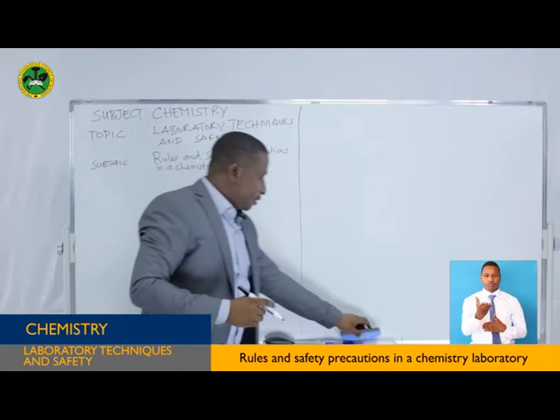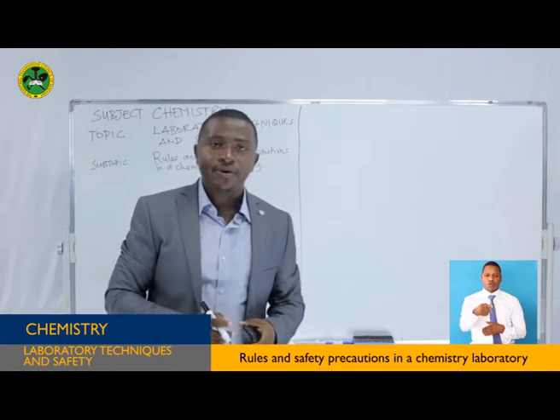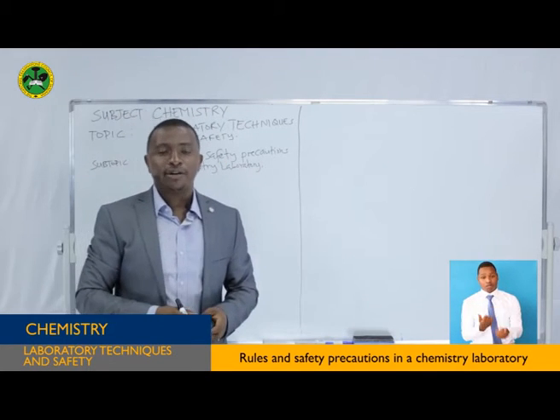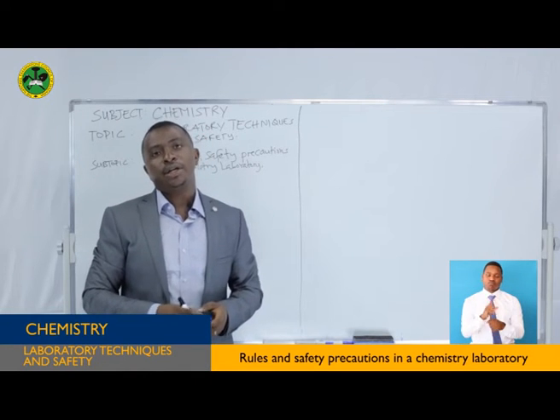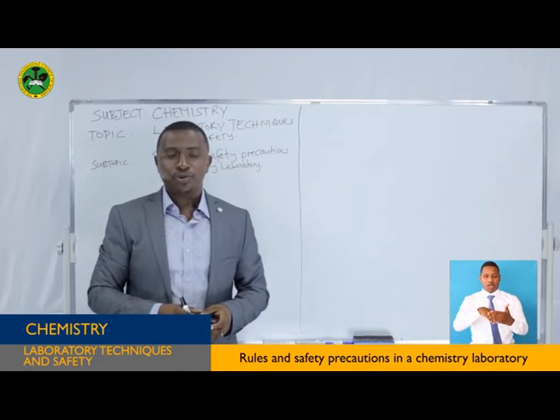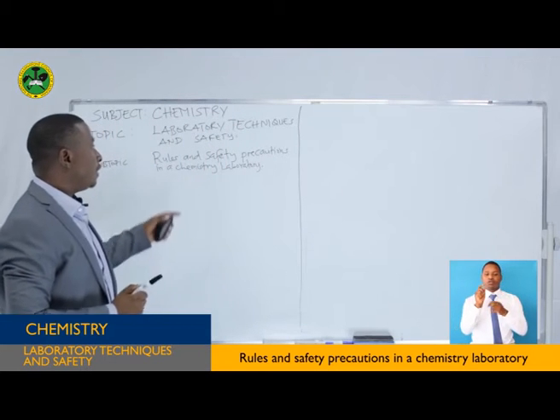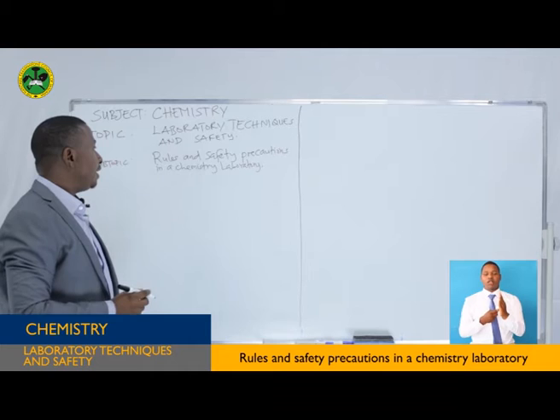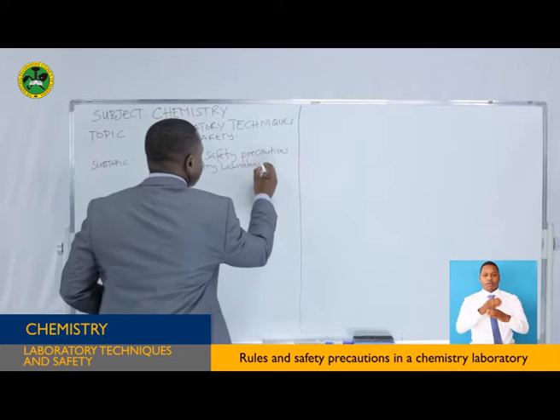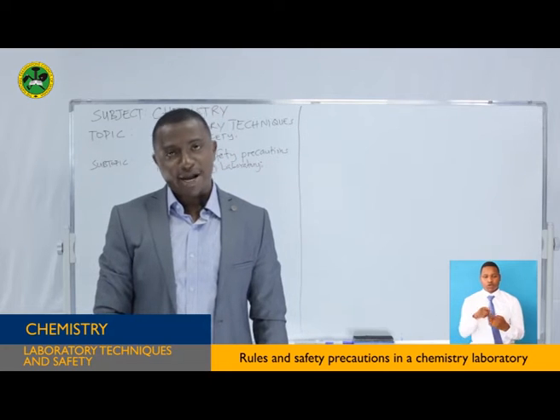Dear students, you might ask yourself why Mr. Moyo is revising this topic. It's because most of the students have been responding poorly to the questions asked in different exams in this topic. So please, you should be with me specifically in the subtopic of rules and safety precautions in a chemistry laboratory. Now we shall start by discussing what a laboratory is.